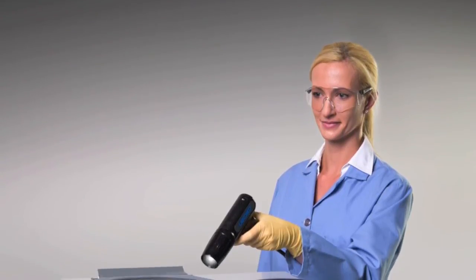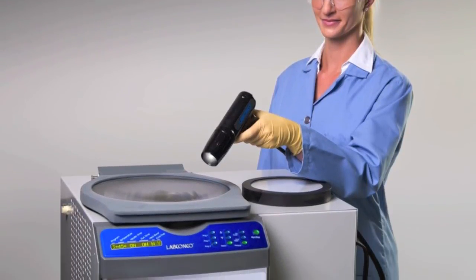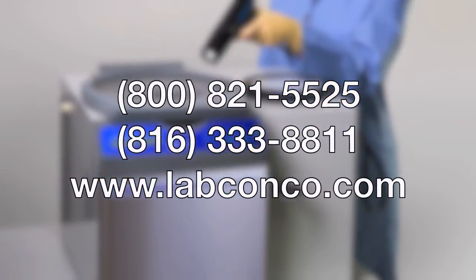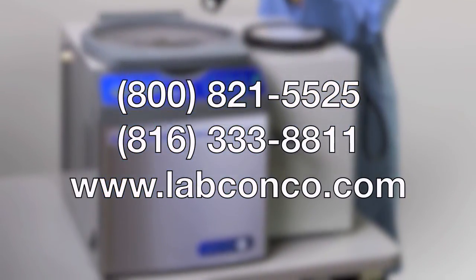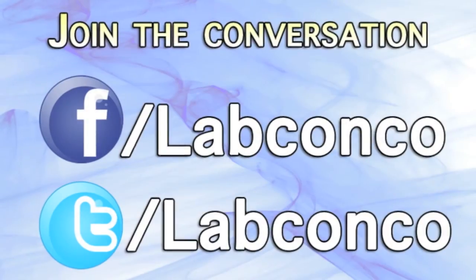The CentraVap Complete is the complete package for evaporation. For more information, call LabConco at 1-800-821-5525 or visit us at www.labconco.com.